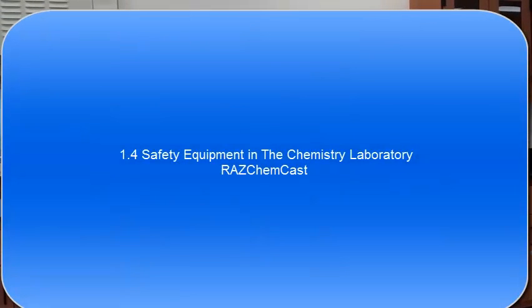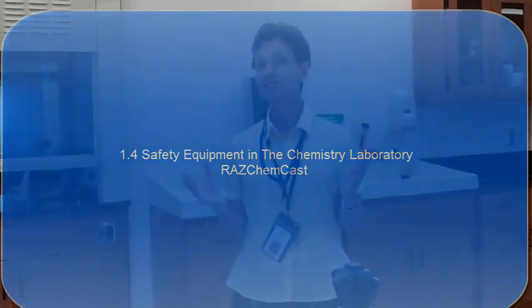Hello everyone. I have to tell you today about safety. Safety equipment in our lab is very, very important.